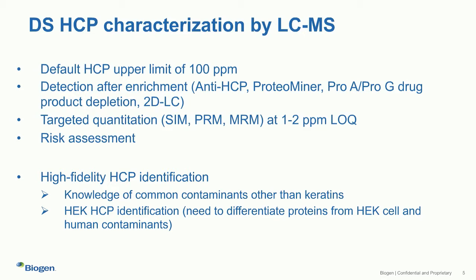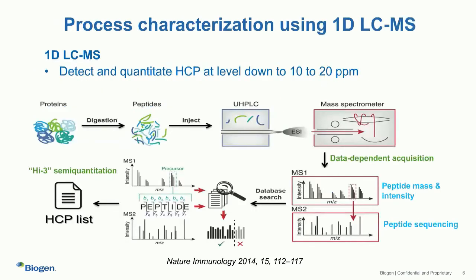So starting from the next slide, Dr. Chongfeng Xu will talk more about technical details and use 3 case studies to illustrate the application of HCP LC-MS to downstream and upstream process development. Please. Okay. First, I would like to thank Dr. Li Zang for the introduction.